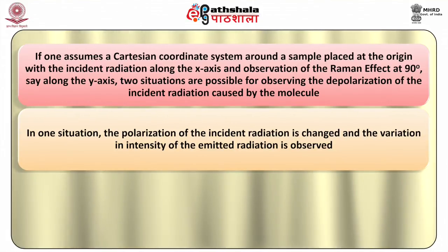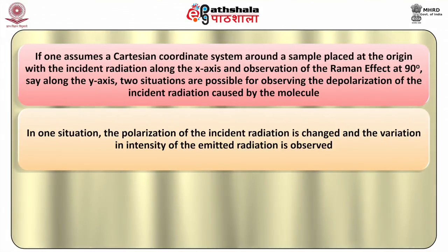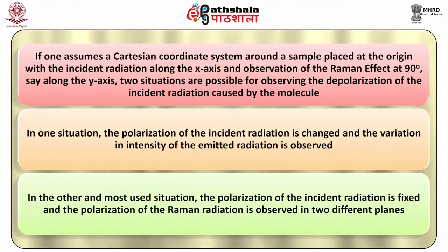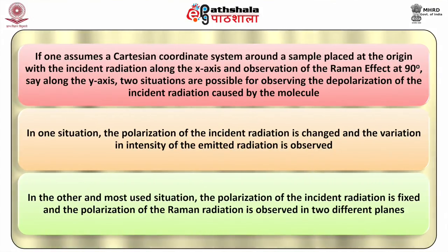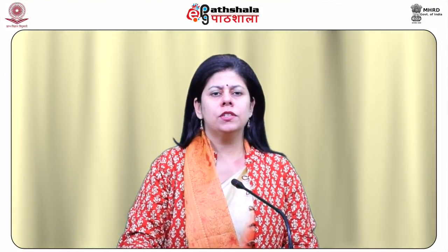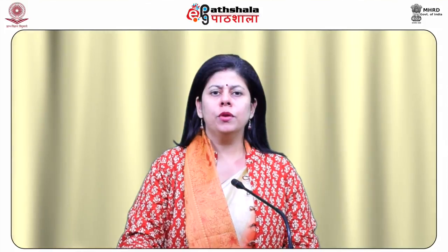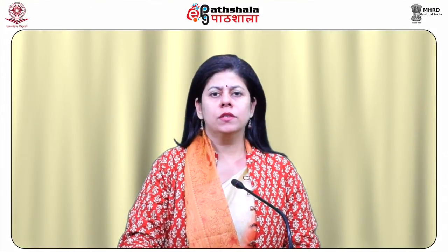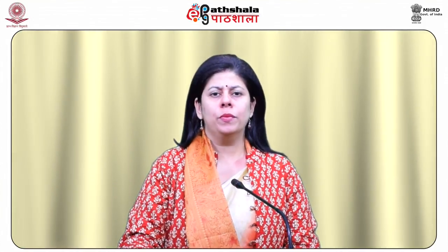In one situation, the polarization of the incident radiation is changed and the variation in intensity of the emitted radiation is observed. In the other and most used situation, the polarization of the incident radiation is fixed and the polarization of Raman radiation is observed in two different planes. In the first situation mentioned, the incident radiation is polarized in the xy plane and then in the xz plane. Unless the molecule depolarizes the incident radiation, the intensity viewed along the y-axis will be 0 for the parallel illumination and a maximum for the perpendicular illumination.